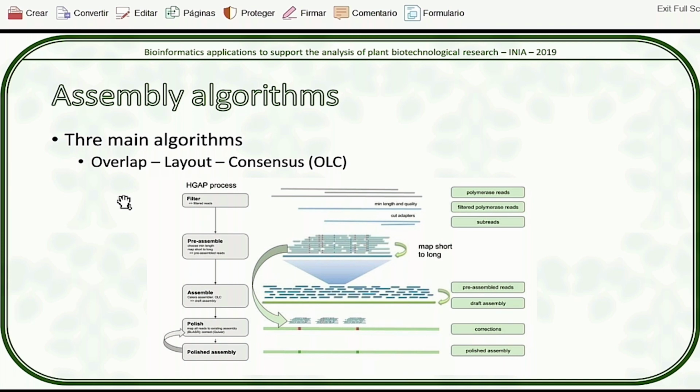Let's assume you finish the overlap part, and you have similarity scores for each pair of reads that you've sequenced. Then you have a very messy outcome. You have a very messy graph. Why? Because some parts are going to be repetitive. Some parts you cannot use a very strict overlap alignment tool because you have to allow for sequencing errors. You also have to allow for certain heterozygosity, because that happens in real life, and that's something you need to be aware of. Therefore, some of the reads will have hundreds, if not thousands, of equally good connections.